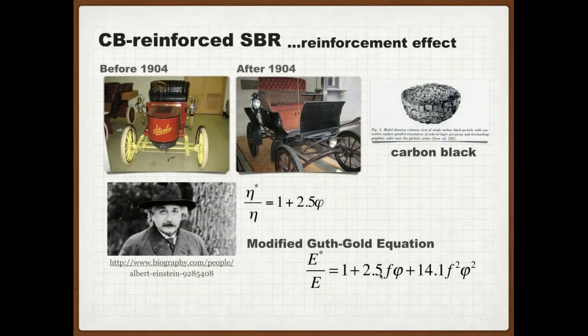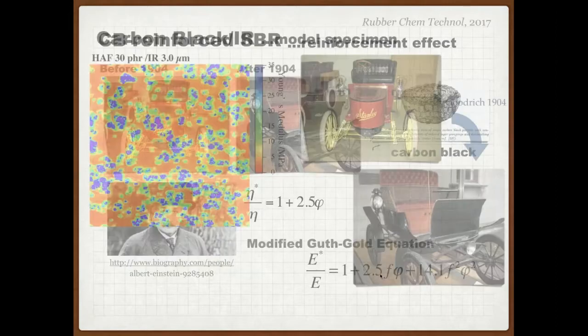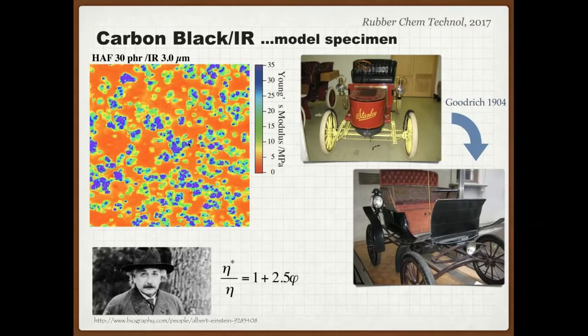Another example of static nanomechanics is on filled samples. I mean some nanoparticles embedded in polymeric materials. Okay, sorry. So this image is the rubber, but it contains a large amount of nanoparticles. Once again this is the Young's modulus map. The rubbery region has a modulus at the 2 megapascal level, and the fillers, of course, are very hard, but we can see some green regions, which is an interfacial region where the Young's modulus is several times higher than the matrix. This increase is due to the strong interaction between filler and the rubber.